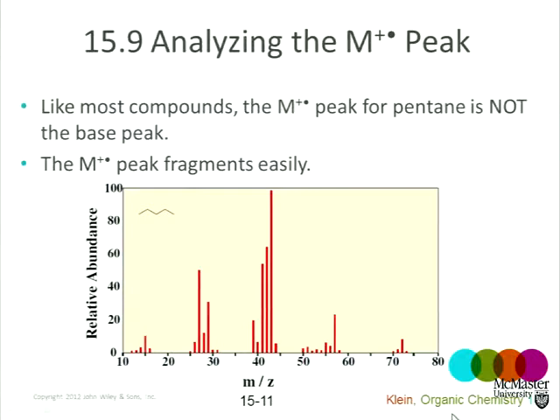Okay, here's pentane. In the case of pentane, we don't have a ring. Fragmentation is easy. So now here's a mass spectrum, a more typical mass spectrum. How do we determine the molecular weight of pentane from this spectrum?